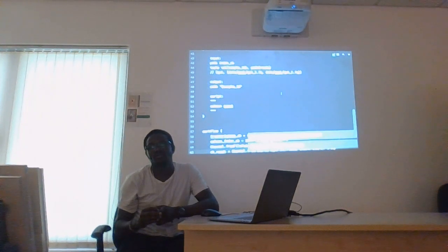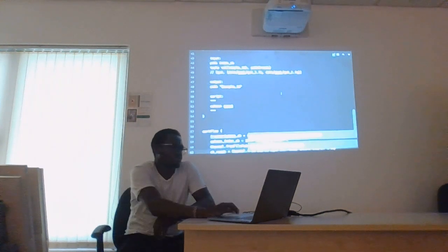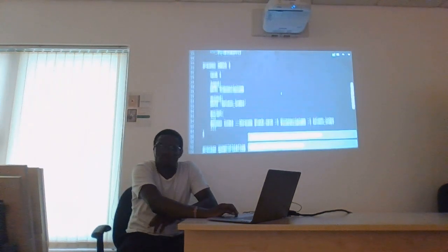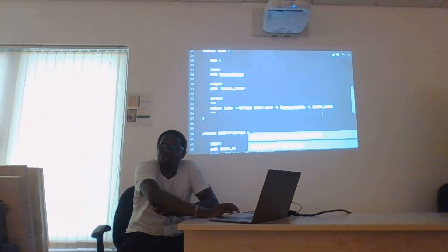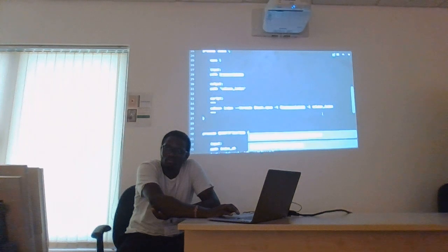Maybe a bit weird. In the script section of the code, for that part, we are explicitly telling it that one of our inputs is the transcriptome and the output is the Salmon index. To make it easy, we could just add the input, considering that your input section may have multiple inputs.